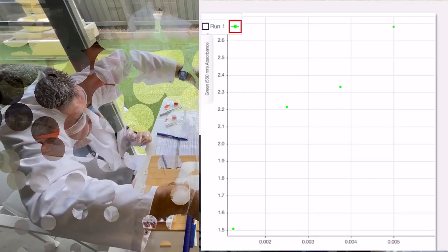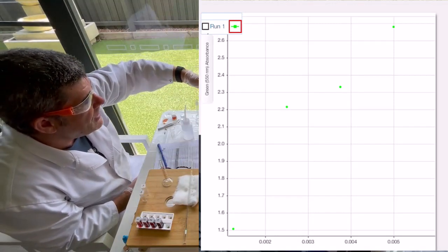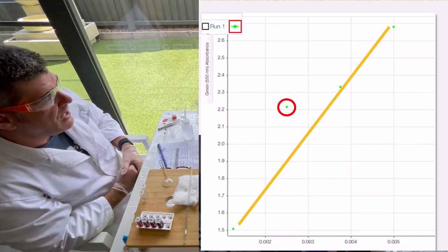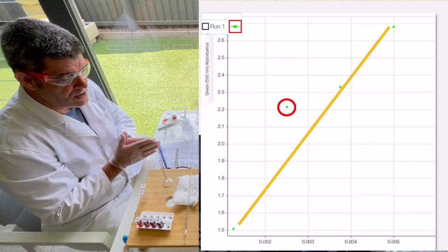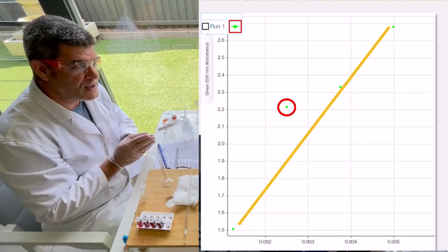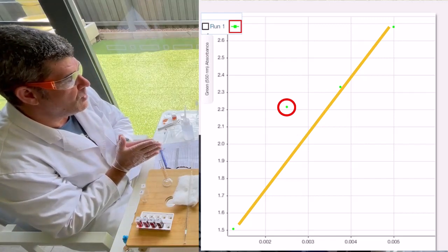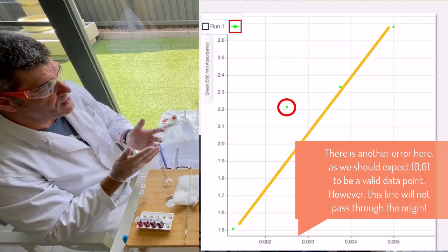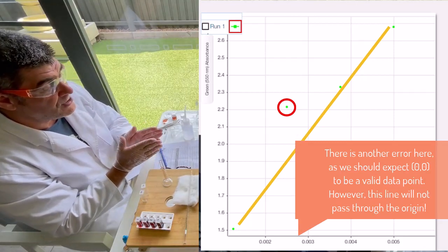and that is what I see. The thing that you might notice about this is that the graph is reasonably straight, but it looks like one of these values is a little bit of an outlier, and that could have just been experimental error, the way that I measured things. We are dealing with very small quantities here, which means that we need to make sure that we're very, very accurate in what we do. Otherwise, small differences can be magnified and have large effects when we're looking at our calibration curves. But this isn't too bad.